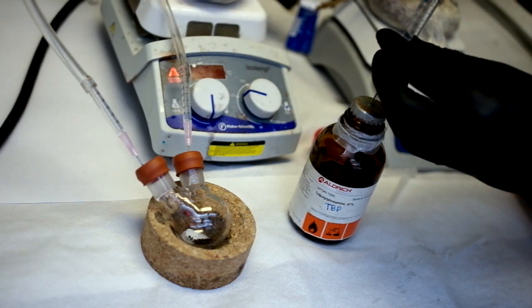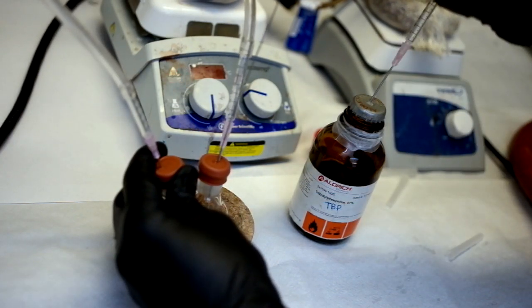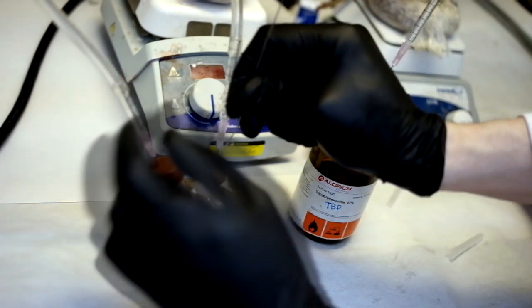Be sure to hold onto the needle of the syringe to prevent leakage. Inject the TBP directly into the precursor flask.